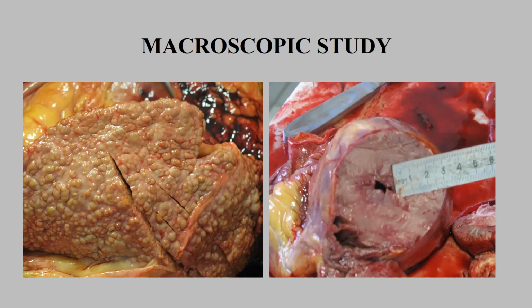We describe this tissue, make some measurements, and make a protocol with all the information. Often it's very valuable information for diagnosis and helps us in microscopic diagnosis.